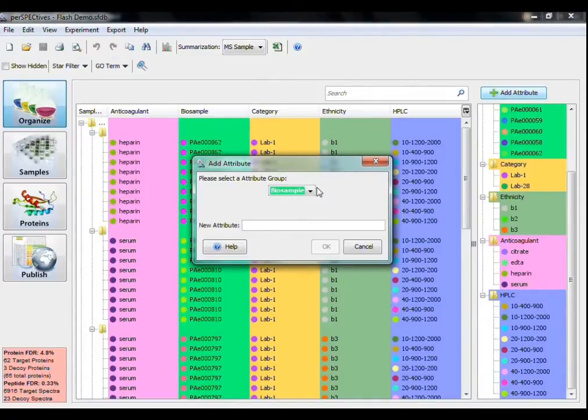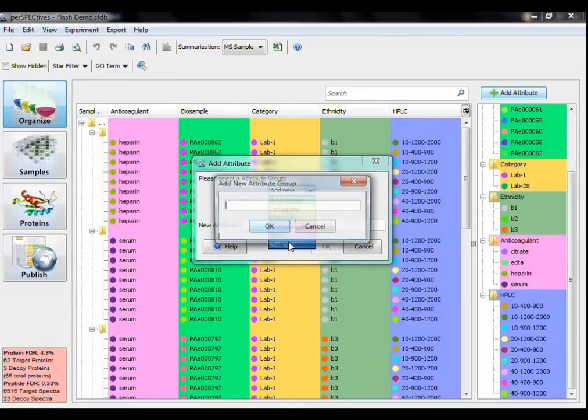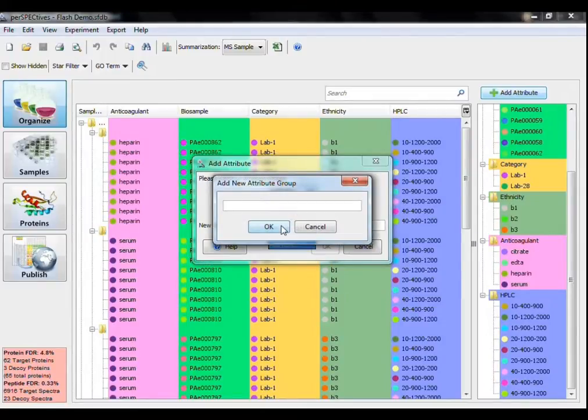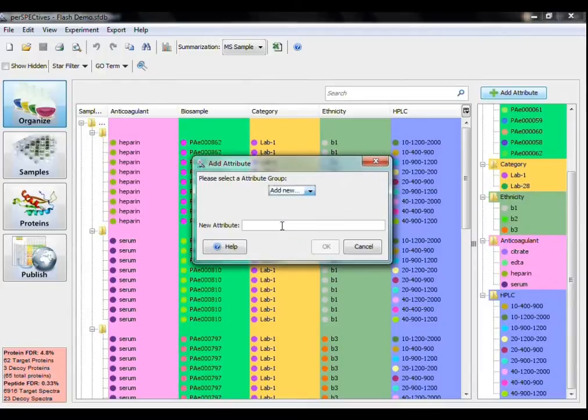First, I have to define the name of my attribute group, so I'm going to select Add New from the drop-down menu here. Then I can define the first attribute in the group.